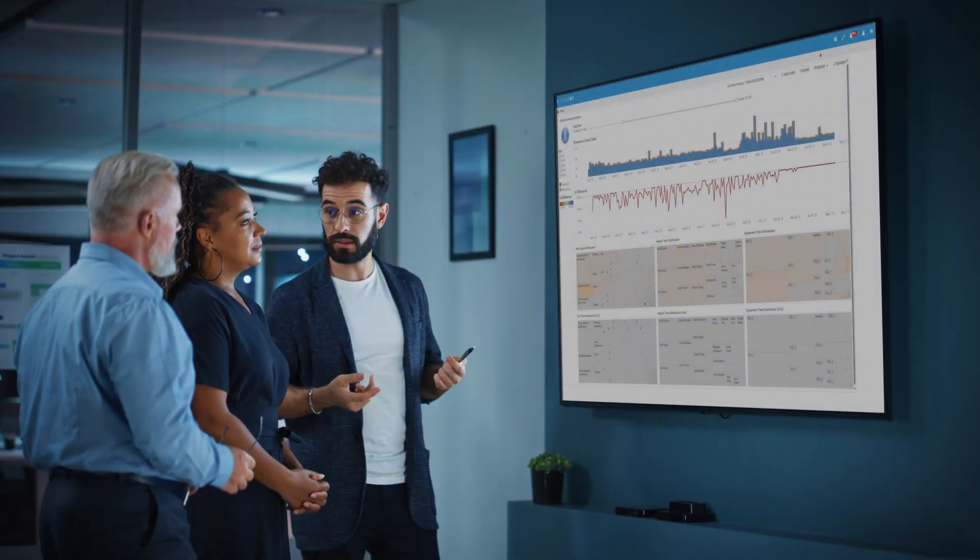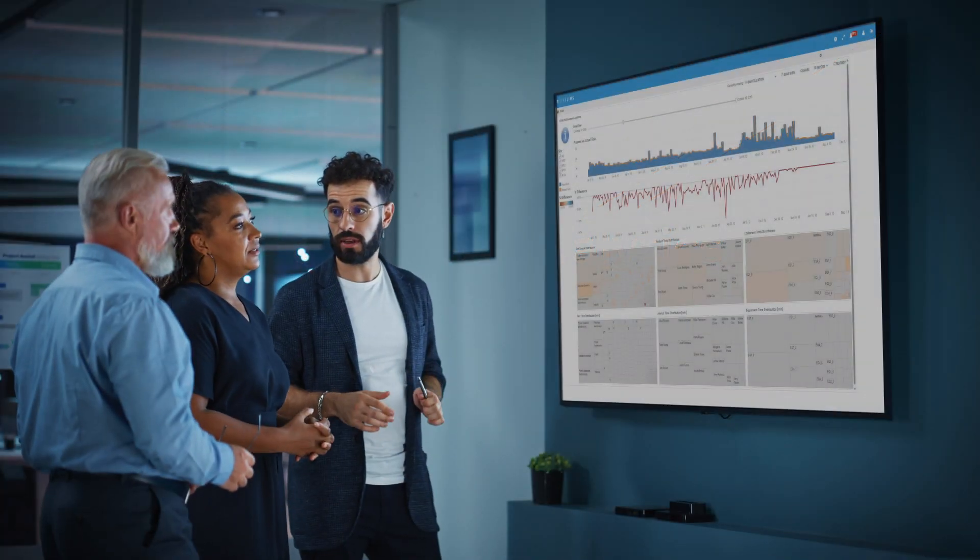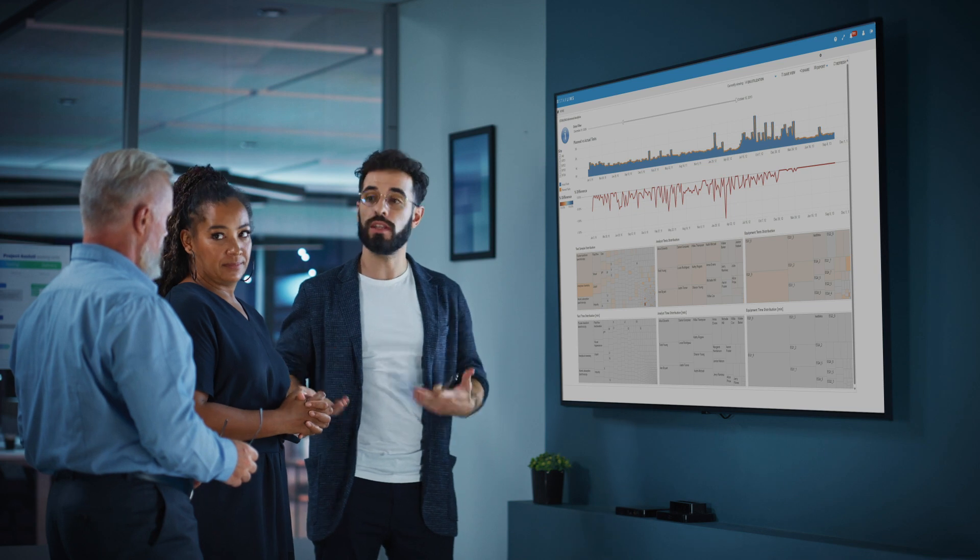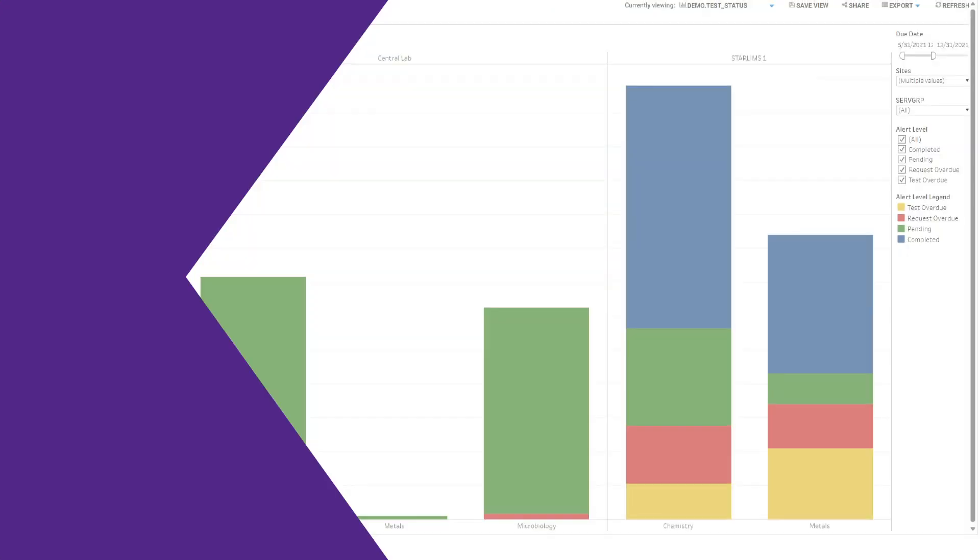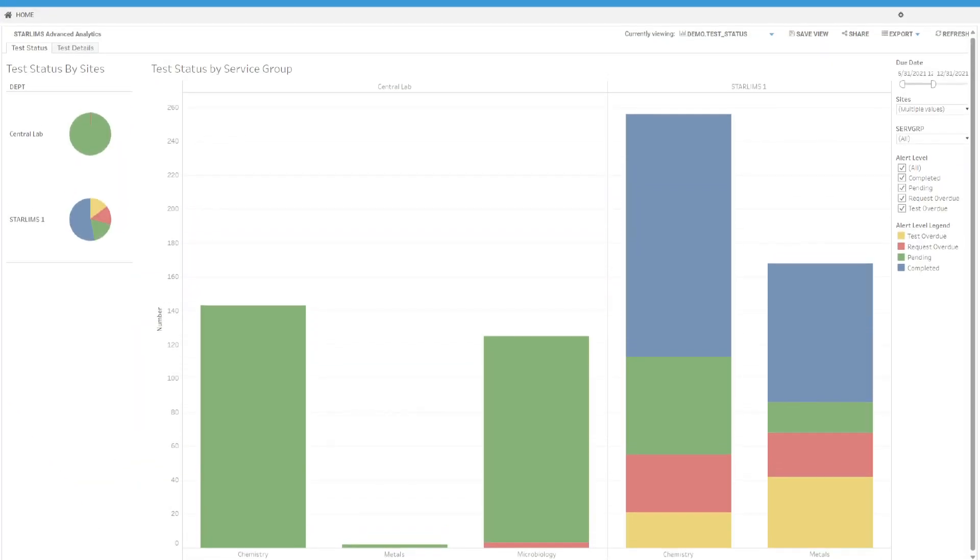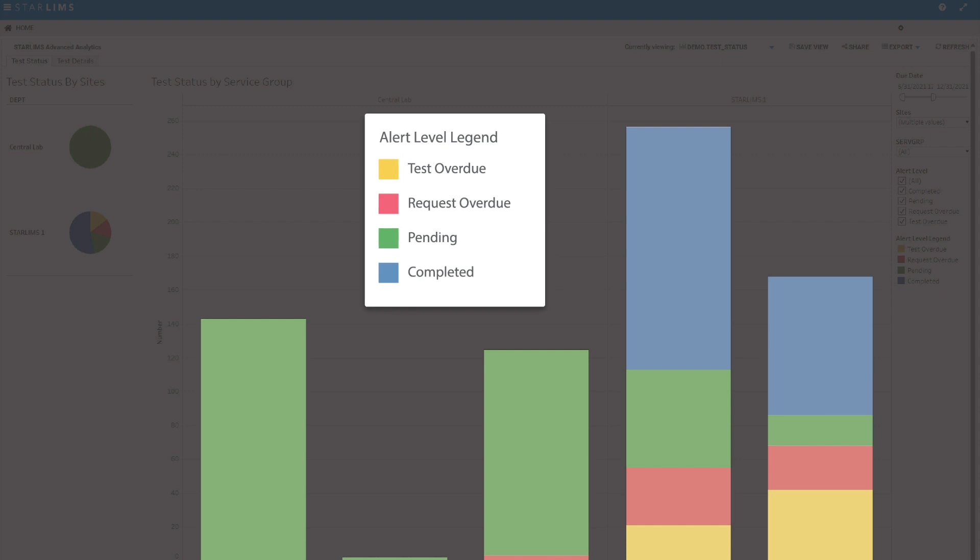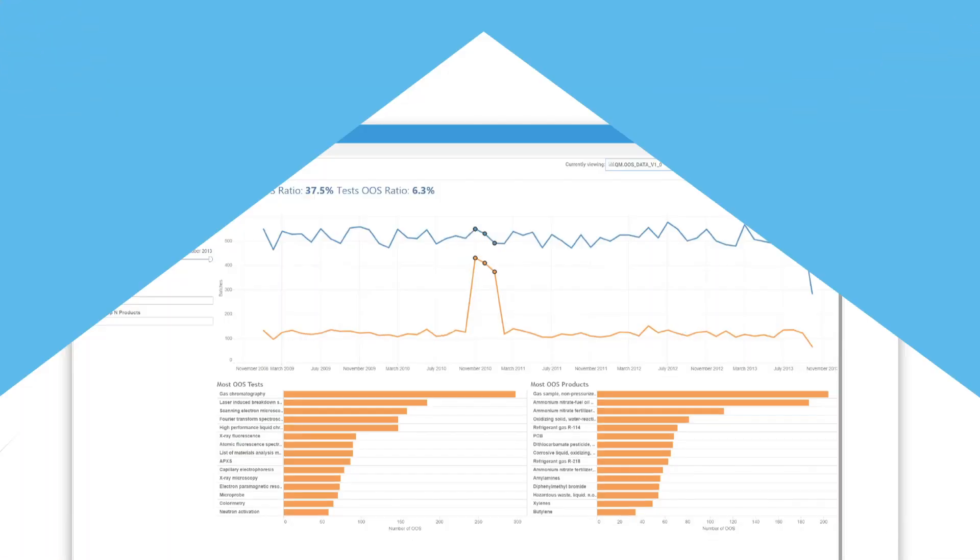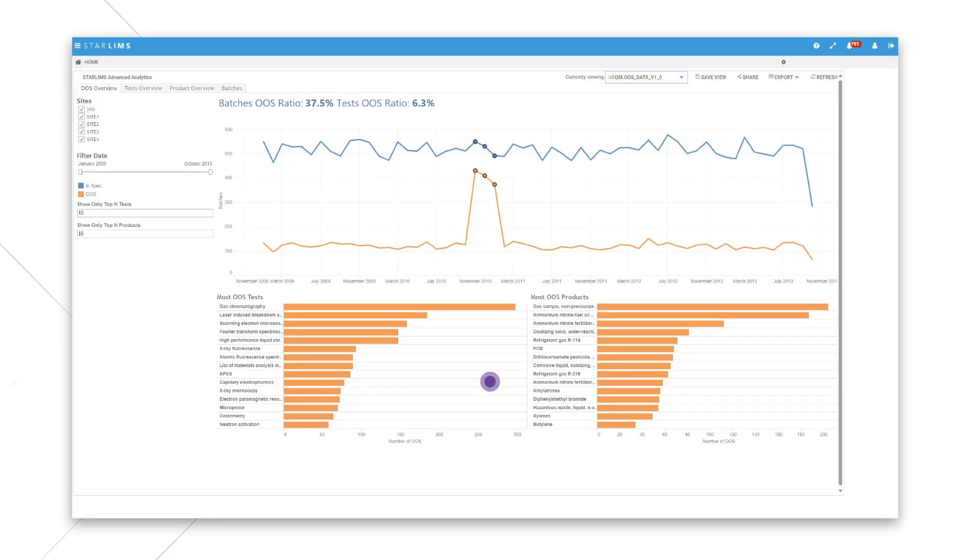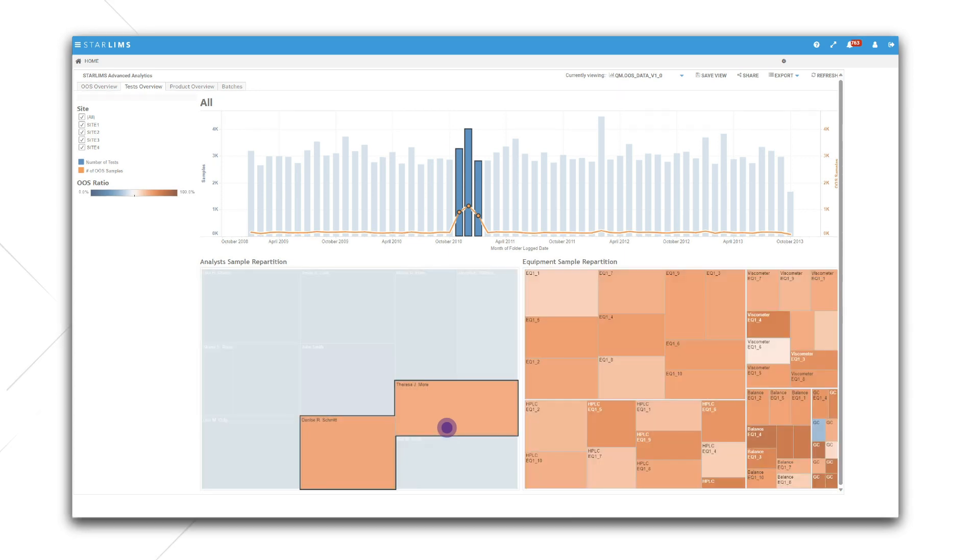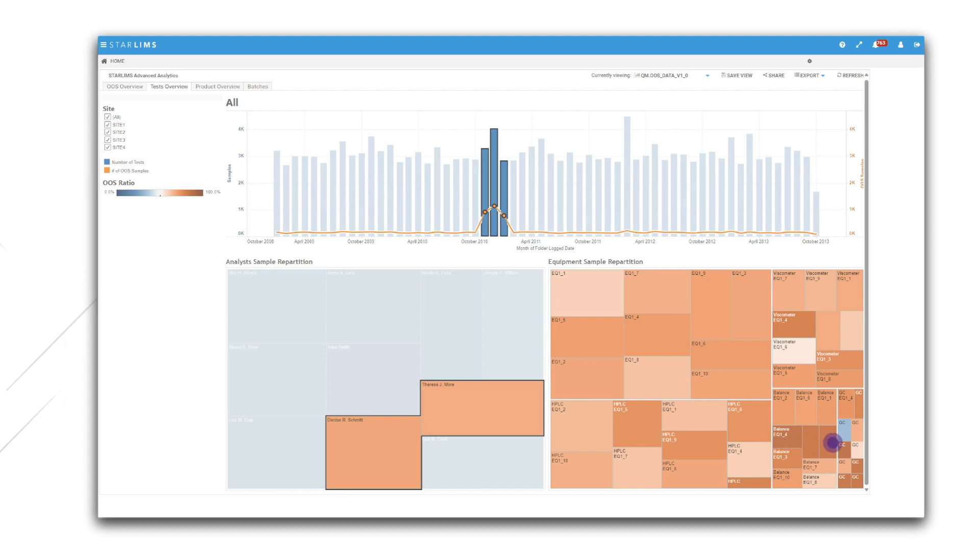Turn your lab data into insights with Starlims Advanced Analytics. Make business-critical decisions faster with reporting at your fingertips. Identify trends, patterns, and bottlenecks to improve lab efficiency. With out-of-the-box KPIs, you can start analysis quickly, or build your own KPIs to fit the needs of your lab.